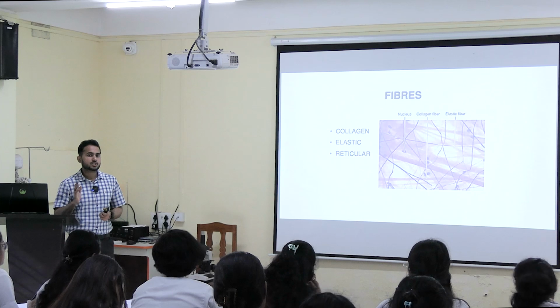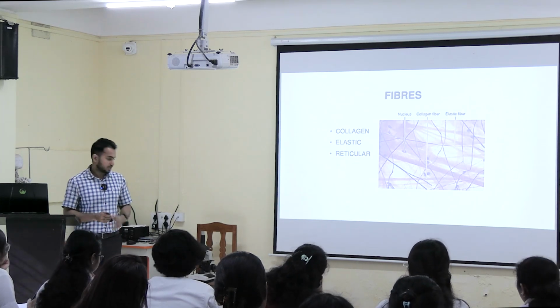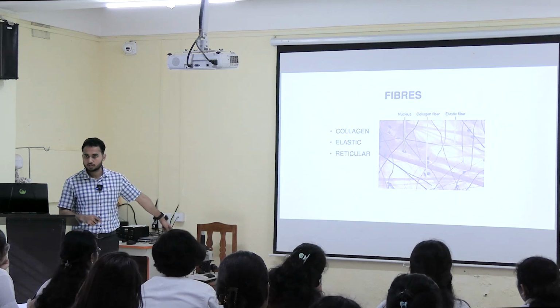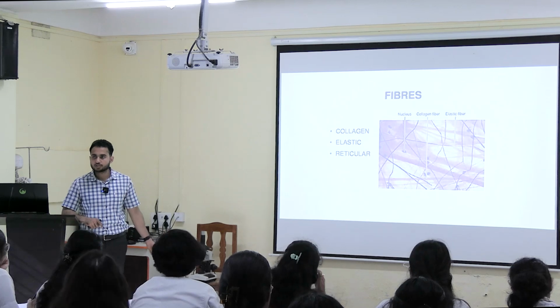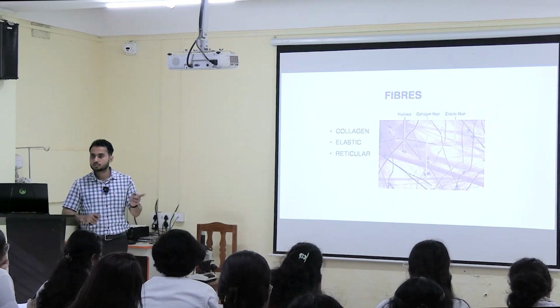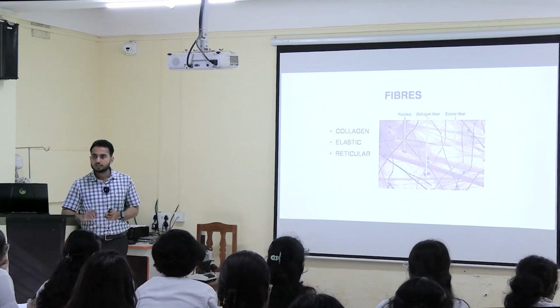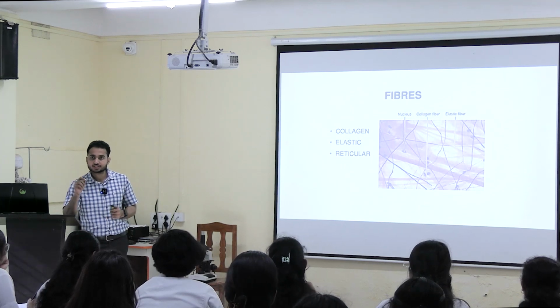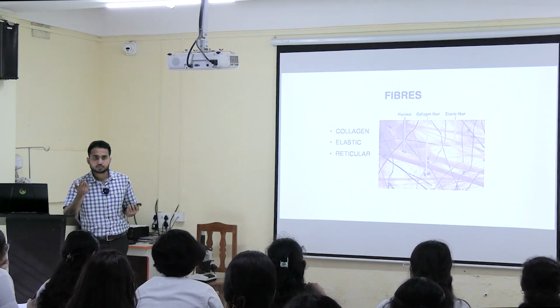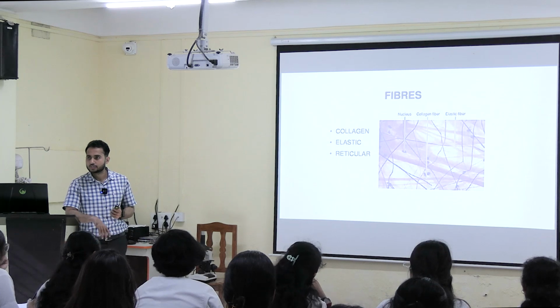Till now, whatever histological images you have seen are of the compound microscope, this type of light compound microscope. The images produced by this type of microscope and the images produced by an electron microscope have huge differences. Fine detail can be seen. Even a small cellular structure, the shape of the cell, the processes, even microvilli, can be seen under the electron microscope. All those things you can't see under a normal light microscope.